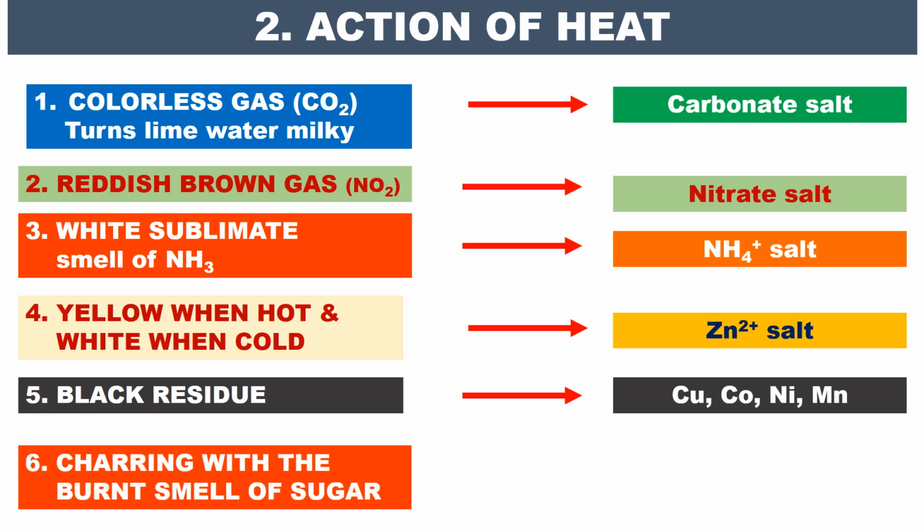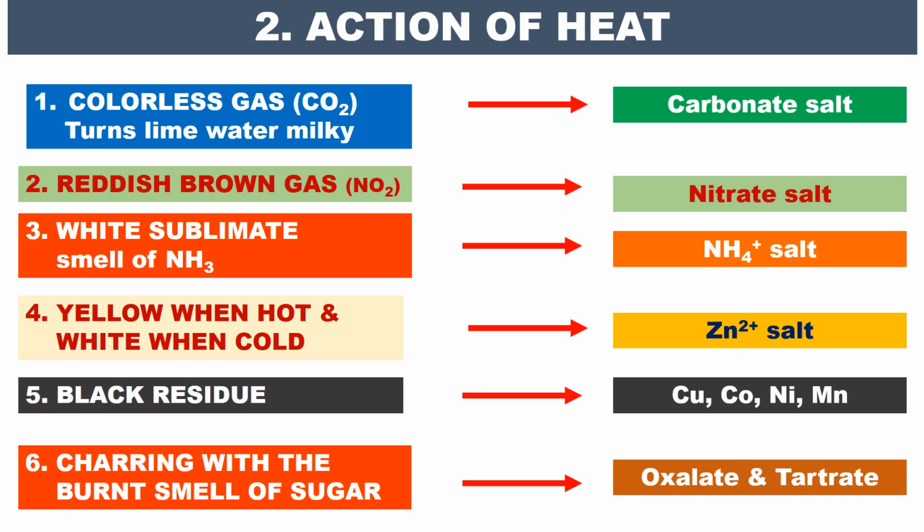Then sixth, charring on heating, charring with the burned smell of sugar, indicates the presence of oxalate and tartrate.